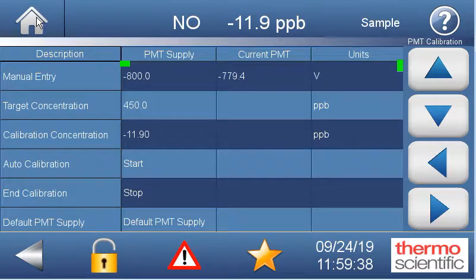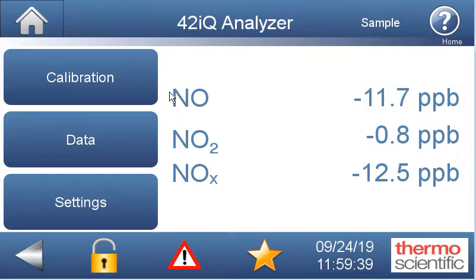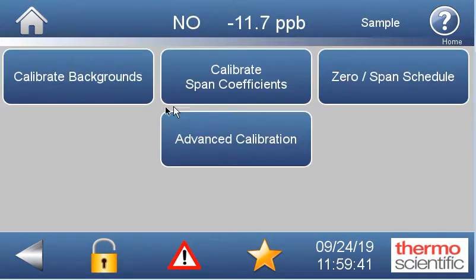Oftentimes after we do a big PMT adjustment, we're going to want to go back, flow our zero gas again, and come in and recalibrate our backgrounds with zero gas.